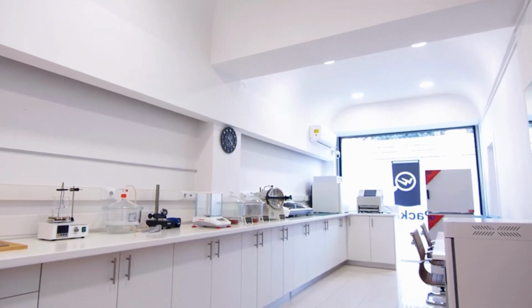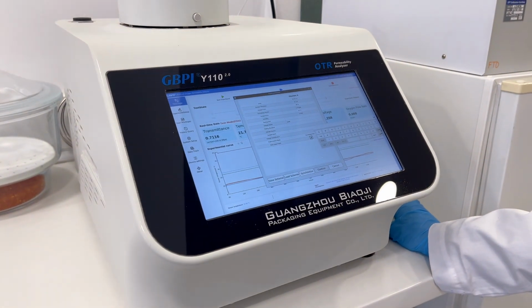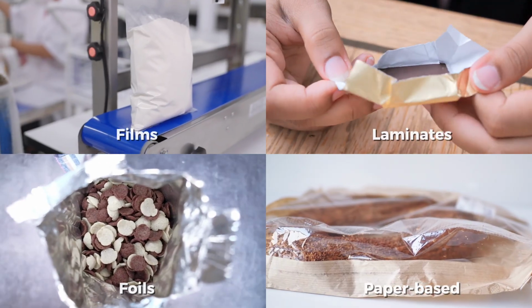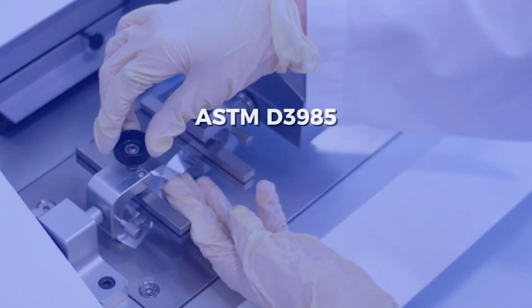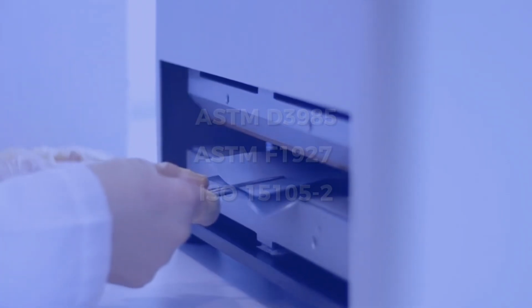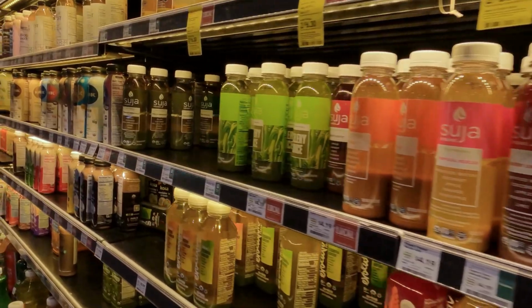At PackLab, we have expanded our in-house testing capabilities with this advanced instrument. This enables faster turnaround times, precise and reliable data, and the ability to test a wide range of materials, from films, laminates, and foils to paper-based barrier structures. We operate in accordance with internationally recognized standards, including ASTM D3985, ASTM F1927, and ISO 15105-2.